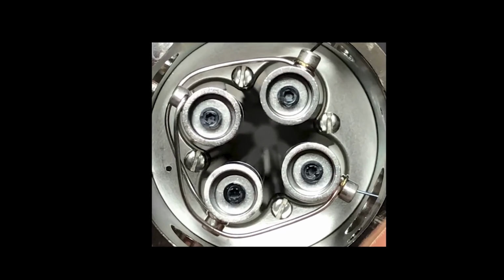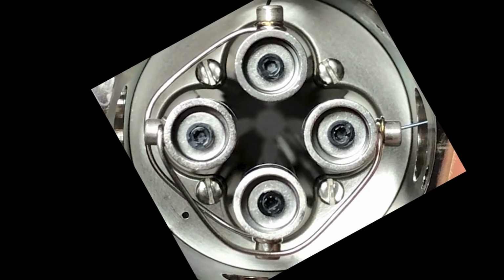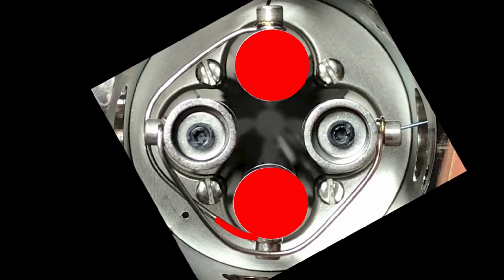All right, so we have 4 poles here, and we're actually going to think of them as 2 pairs of poles. So let's start with this first pair. These 2 guys are paired up. You can see they're connected by the wire, so we have the red pair here. And we're going to apply electrical fields to these. Let's take a closer look at the fields that we're going to apply.